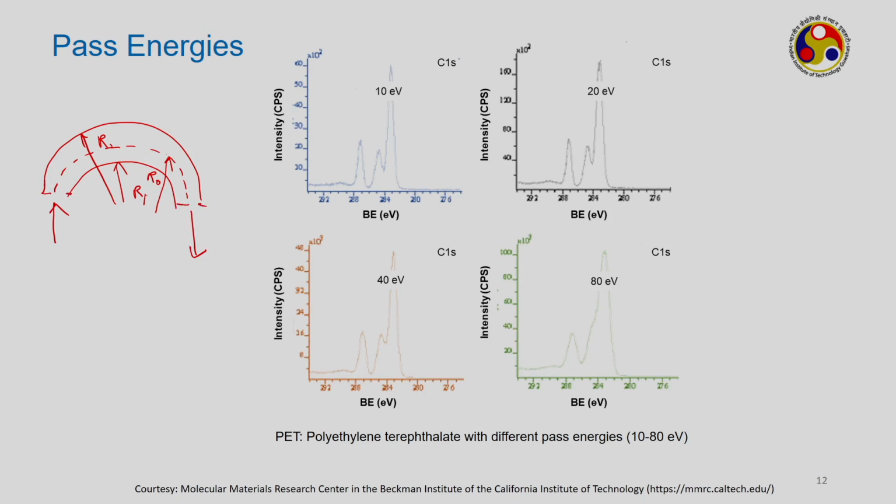Now what you want to do is control the various electrons which are coming out from the sample and entering this analyzer. Those electrons are characterized by the net energy. How do you characterize by the net energy? Obviously, you slow it down in such a manner that only energies corresponding to E naught will pass through this width.